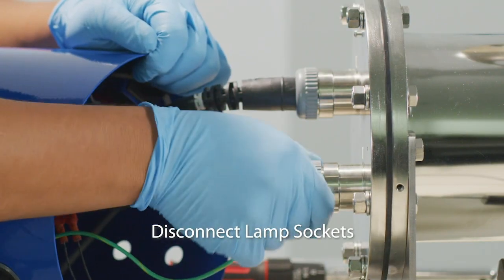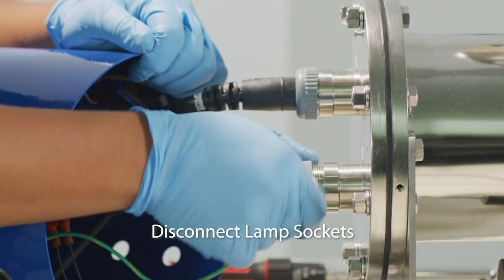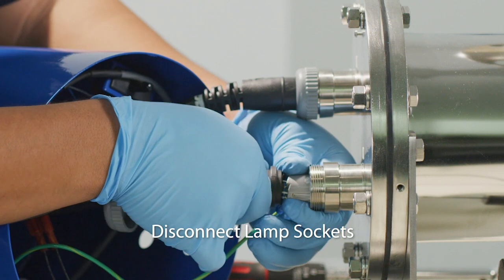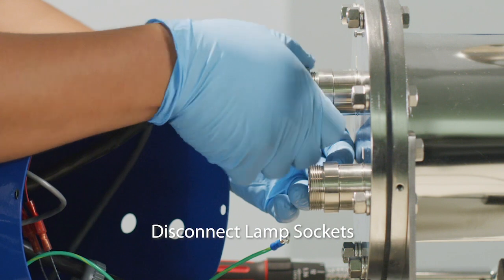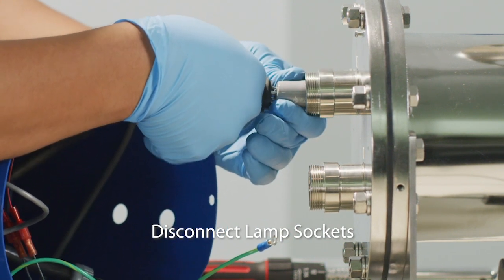To free the lamp sockets, turn the gray plastic compression nut caps counterclockwise until freed from the metal compression nut. With the end cap removed, pull the lamp socket part out of the chamber until the lamp socket connection is fully exposed. The lamp socket can then be gently pulled apart from the angled UV lamp pins.